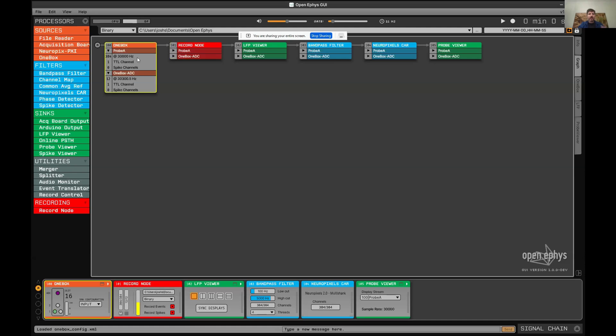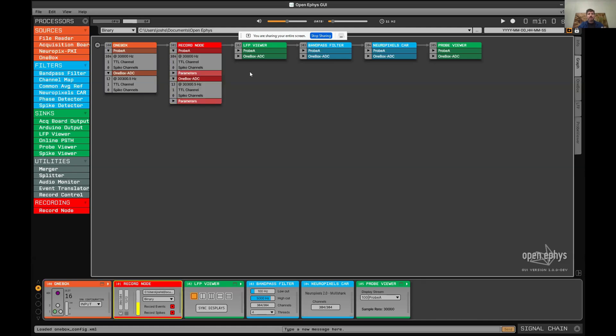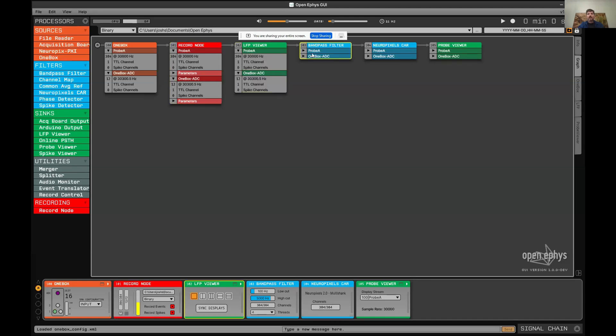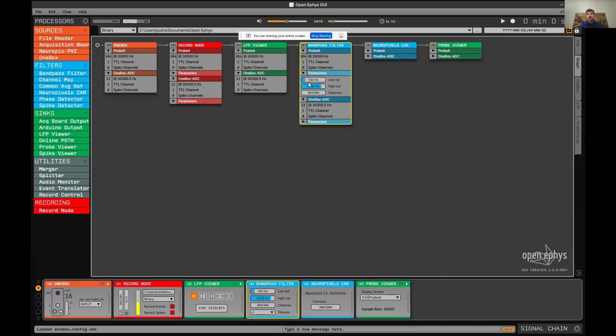All of these streams propagate to downstream plugins, for example, record node, LFP viewer which allows you to visualize the data, and bandpass filter. Some of these plugins have different parameters that you can change. For example, the bandpass filter, you can change the low cut and high cut.